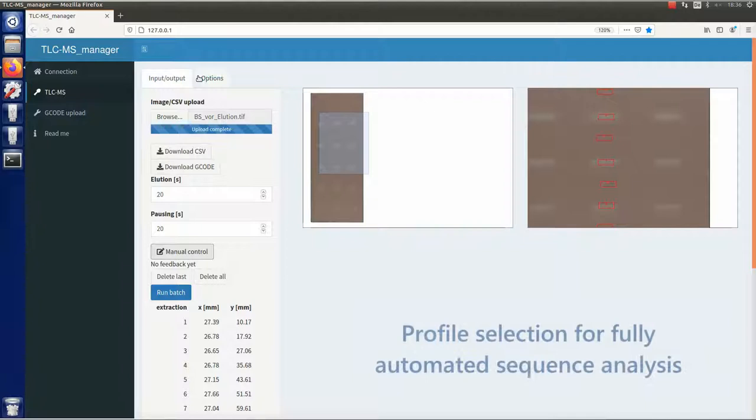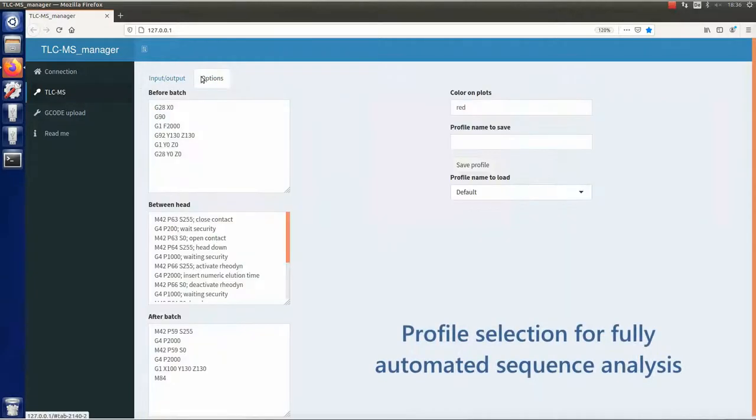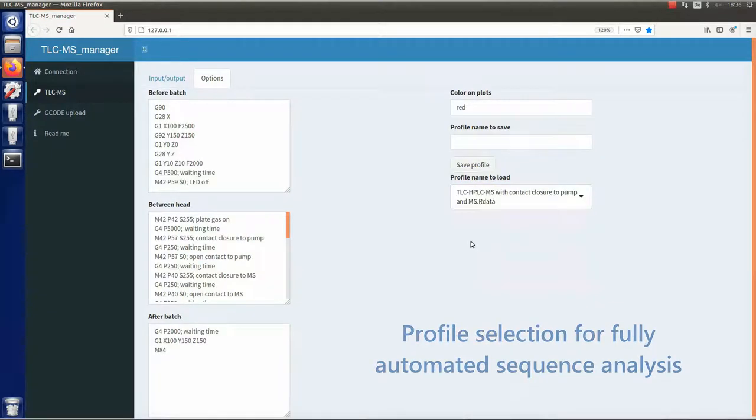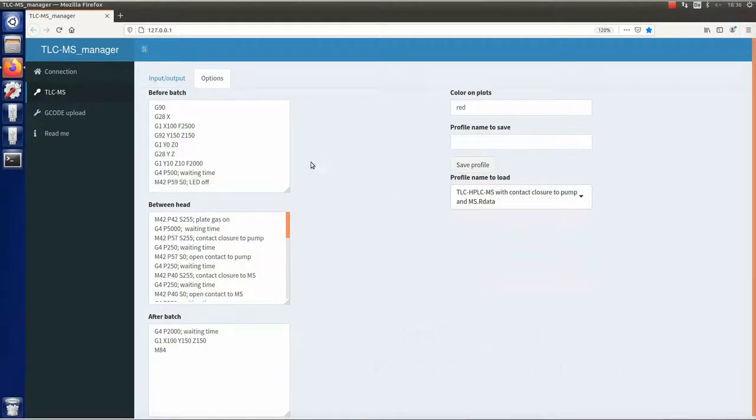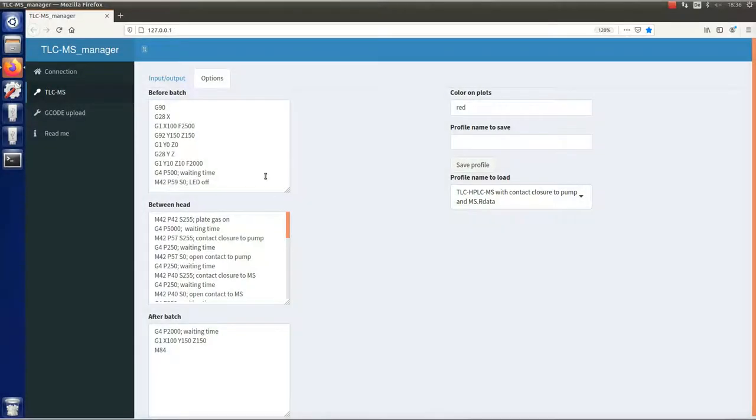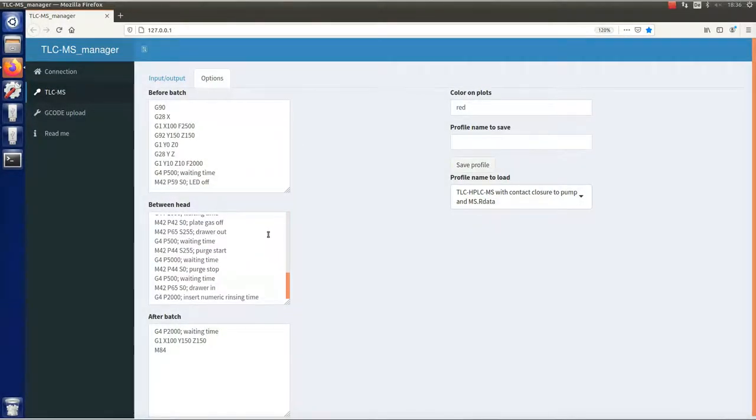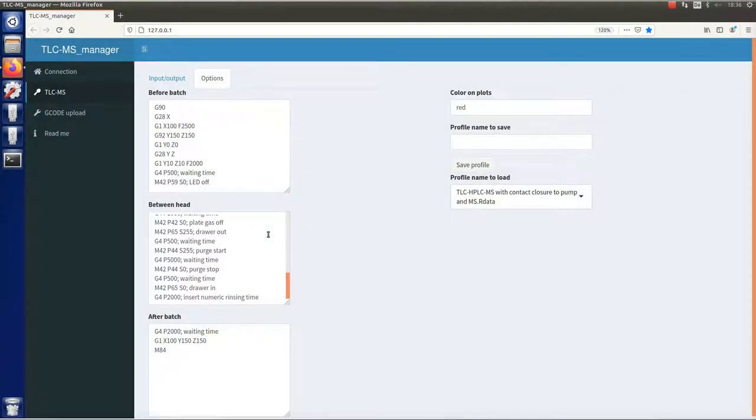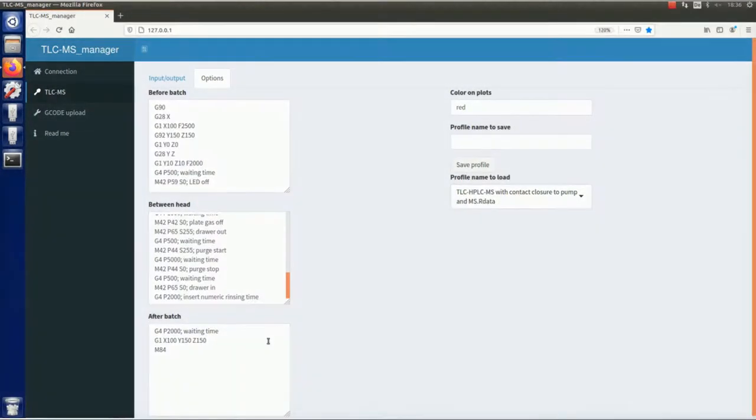Various elution profiles suitable for different setups can be chosen and adapted if necessary. All commands before batch are only performed once before the batch. All commands between head are performed repeatedly in between each elution. All commands after batch are only performed once after the batch.